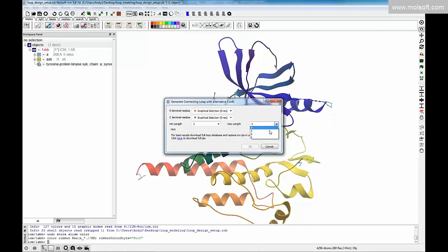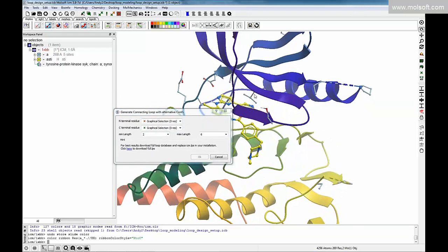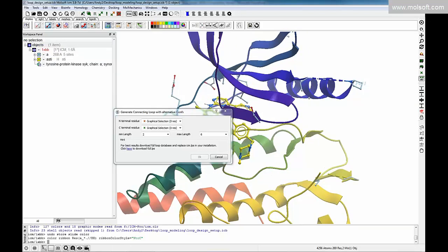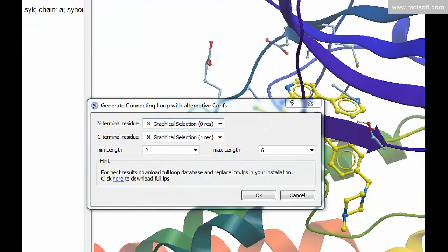So it's a big gap. So you put 6. Okay, so the N terminal, we make a selection. It's got to remember which side is, I think this is the N terminal, this is the C terminal. So the N terminal, we select it, and it's looking for this orange cross, so it's looking for an orange selection. If you can see, it's orange and green.